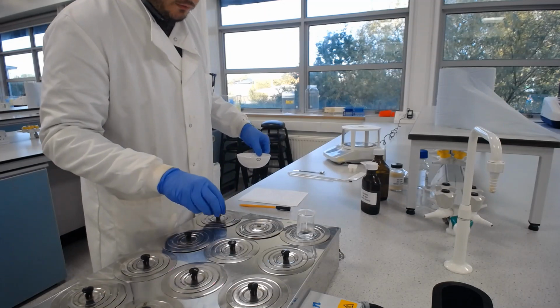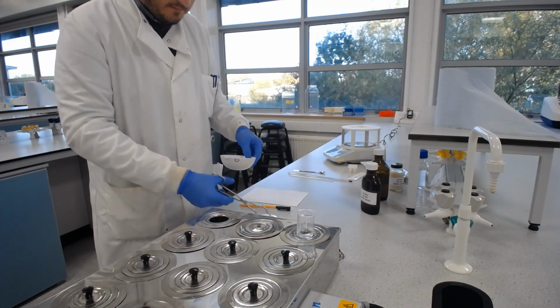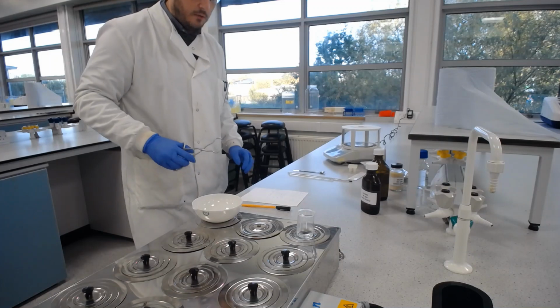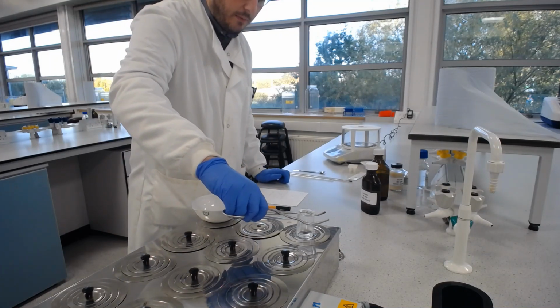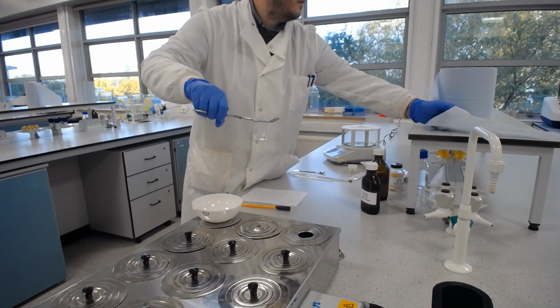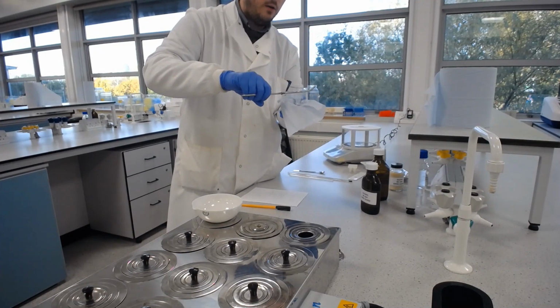Now this needs to go onto the water bath, and as I said before, I probably want a slightly larger ring. There we go, so I'll keep those together down there, and I've got both of those things now on the water bath. I'm just going to check how much of my water has evaporated at this point, so I don't have too little. Just going to wipe the bottom of that, so I don't weigh the condensation instead.